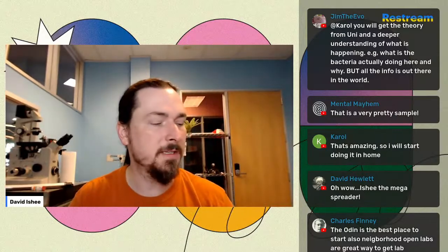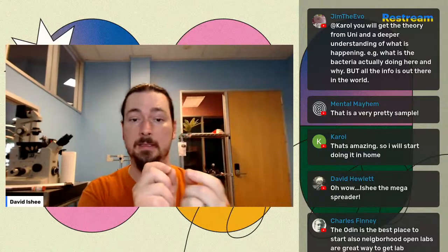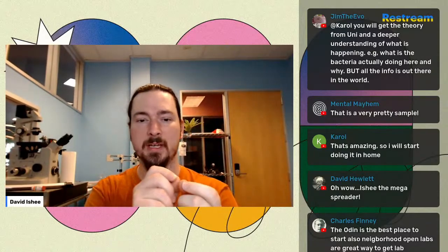I tested in a few other plants. And sometimes the plants actually need damage. We tried one of these decorative plants, and some things have really thick leaves. That's another point I was going to make. Some things have really thick leaves, and what you have to do is make a starter hole. You can just take a needle and punch a hole in it, and then follow through with the blunt syringe, and it'll flood in there really well. But the skin on some of these tougher leaves just doesn't work very well.